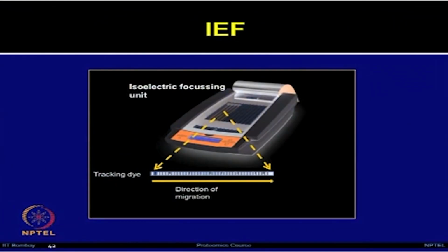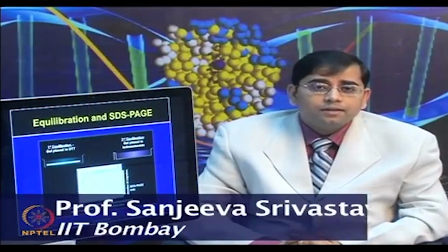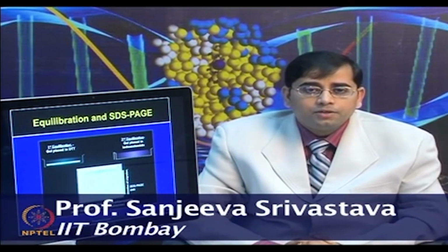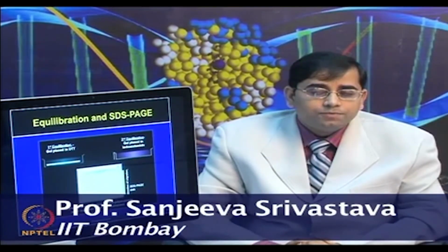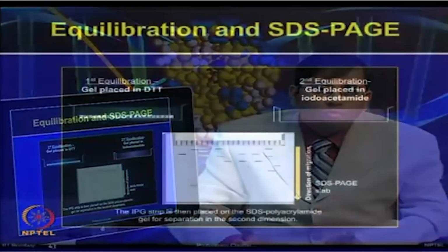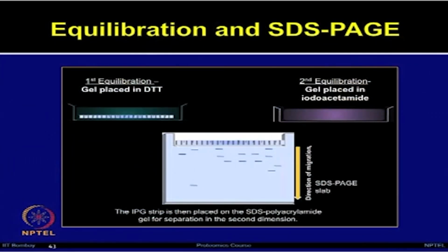Now, this rehydrated strip can be focused in an isoelectric focusing instrument. It is a good idea to avoid any light exposure during the rehydration, dye reconstitution process as well as while the isoelectric focusing run is in progress. Once IEF is done, again you have to do the equilibration, first equilibration and second equilibration, followed by SDS-PAGE. So, overall, as you can see, the steps are exactly the same as what one does in 2-dimensional electrophoresis.